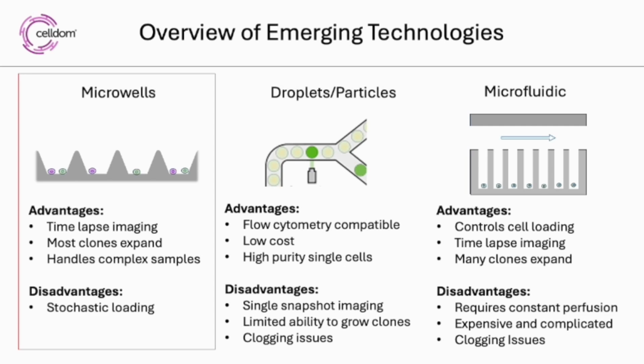However, these microwells can be identified through time-lapse imaging and discarded. Therefore, the main symptom is that only 1/3 of the microwells will have a single cell. However, in our case, this means that we still have 100,000 microwells with single cells in each experiment.